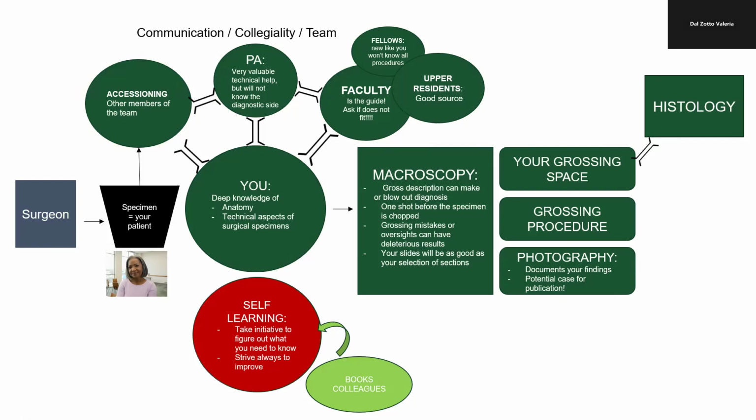So we are going to teach you the appropriate vocabulary for every specimen, or the majority of the specimens that you are going to learn. Know that you have one shot before the specimen is chopped. So make sure that you know the procedure. Sometimes grossing mistakes or oversights can have deleterious results in the final diagnosis. And your slides will be as good as your selection of the sections.